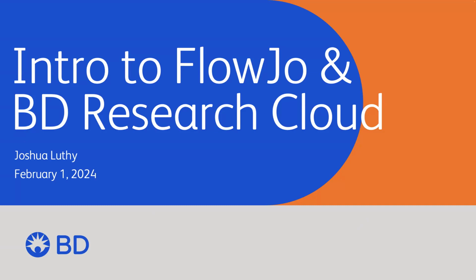Today, we're doing the Intro to FlowJo and BD Research Cloud webinar. My name is Josh Luthy. I'm part of the FlowJo product innovation team here at BD. At any point throughout the presentation, if you have any questions, feel free to enter them into the chat, and I'll try to answer them as we go along.